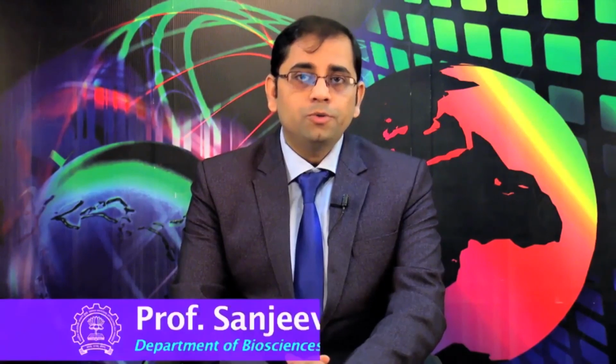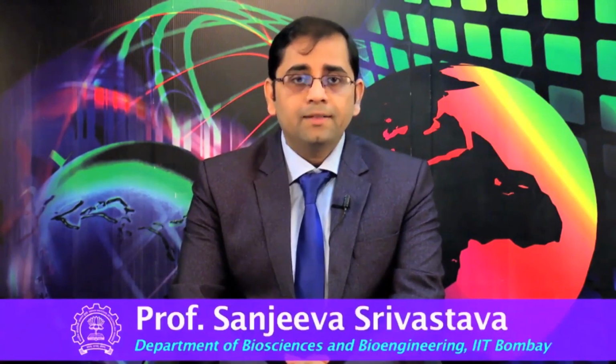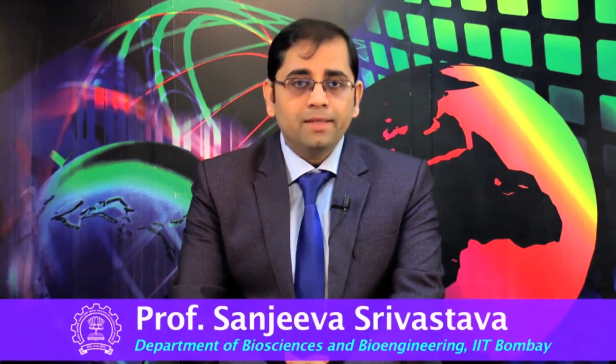We are now moving on to mass spectrometry based data analysis, and in this light a new method which involves data independent acquisition or DIA will be discussed today. DIA is an MS technique which involves fragmentation of precursor ions within a selected m/z range. It differs from data dependent acquisition or DDA, where only selected precursor ions based on their abundance are fragmented.